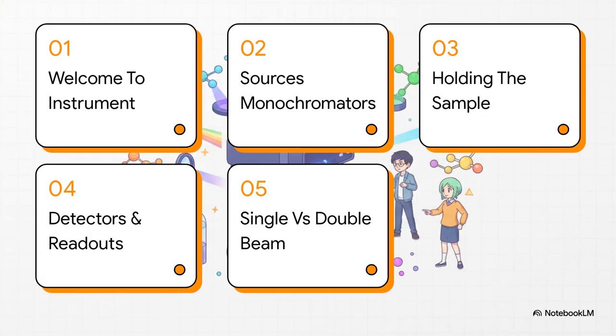Here is the roadmap for today's masterclass. We'll welcome you to the instrument, look at sources and monochromators, talk about holding the sample, dive into detectors and readout systems, and finally compare single versus double beam setups.